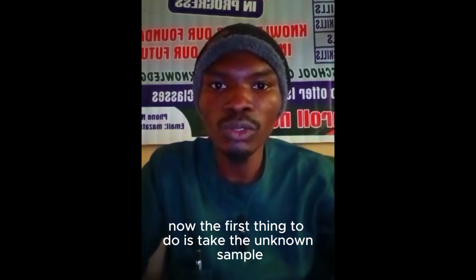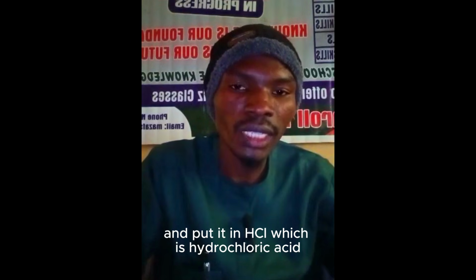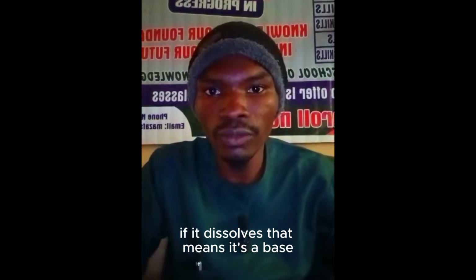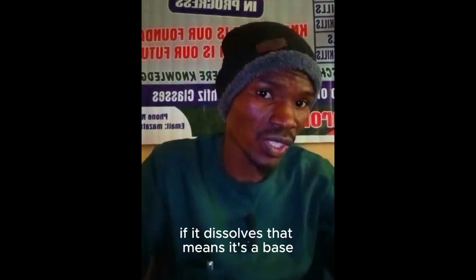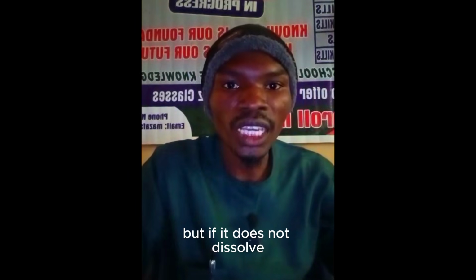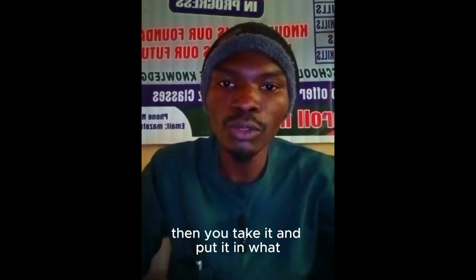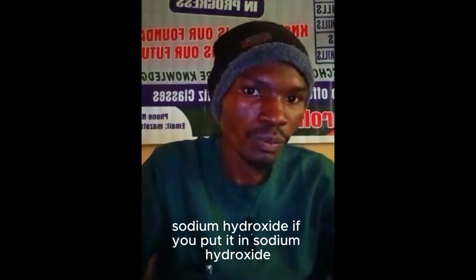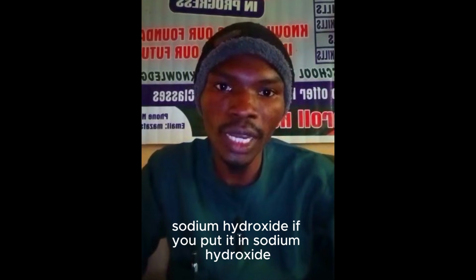Now, the first thing to do is take the unknown sample and put it in HCl, which is hydrochloric acid. If it dissolves, that means it's a base, and if it's a base, then it's definitely amine. But if it does not dissolve, then you put it in sodium hydroxide.